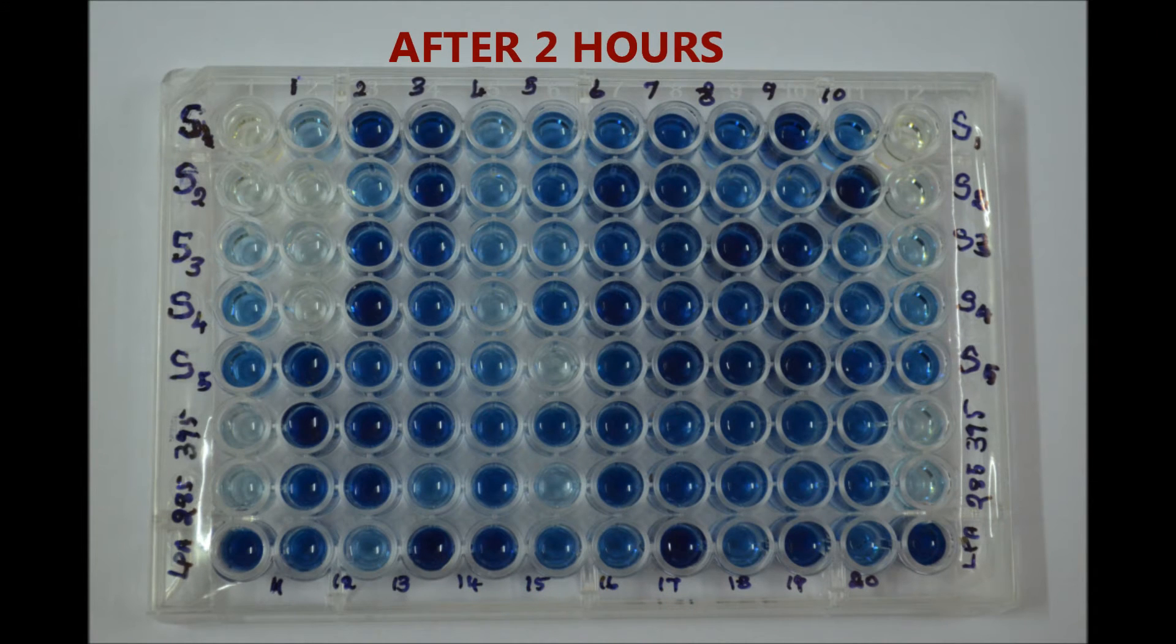a blue color phosphomolybdate complex forms in 1 to 2 hours. Dark blue color indicates the presence of high amounts of free phosphorus in the sample.